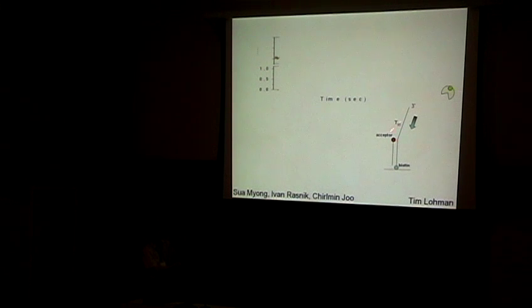So you have the DNA on the surface, and the protein is diffusing in solution. You don't see the protein because it's moving so rapidly until it binds to the DNA. Then you see fluorescence start appearing on your screen at that location, and you can measure intensities of the two dye molecules as a function of time. So what you hope to see is an increase in FRET. And we thought that once that has happened, the protein cannot unwind the DNA, so it simply dissociates from the DNA.